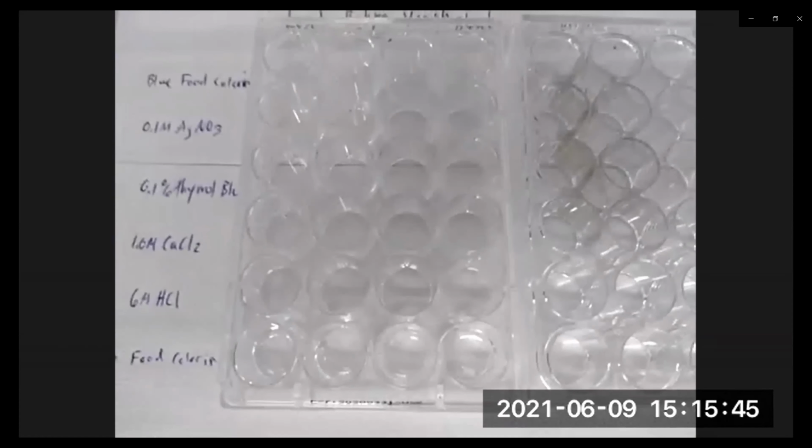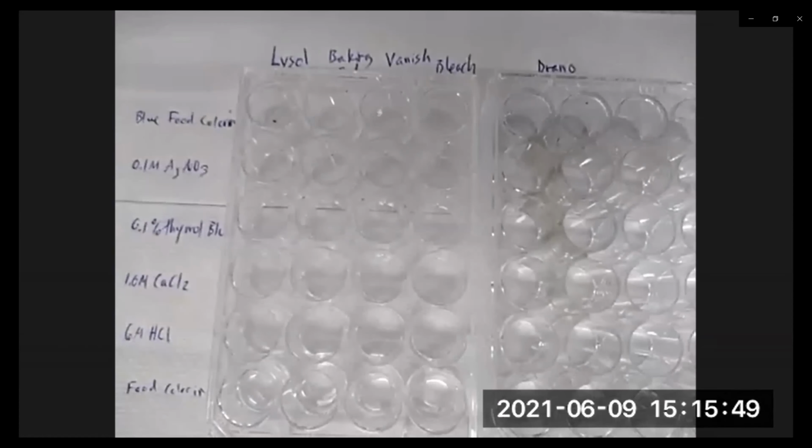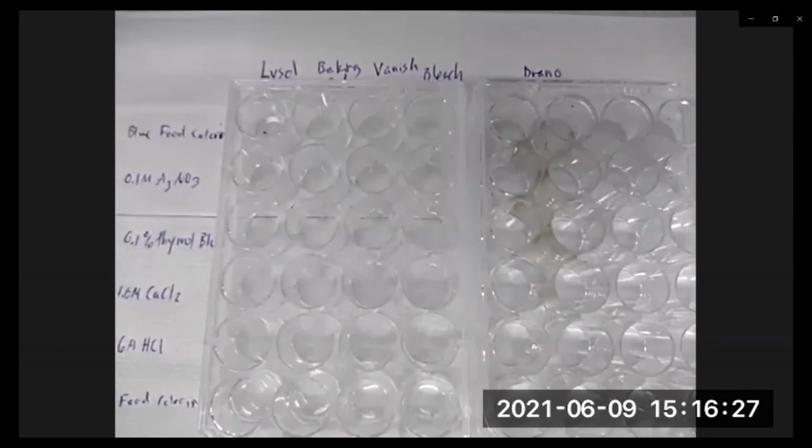So now all the household reagents have been added to the cell well plate. Now we're going to add green food coloring to each cell well to see what happens.